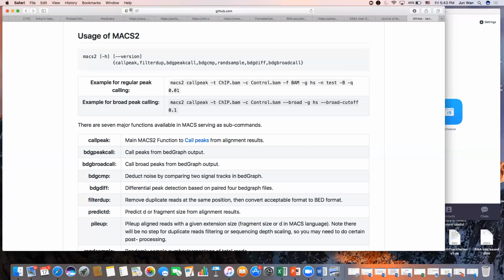Dr. Wan, would that be the advisable step, seeing an IT person for permission? Would that be recommended? Yes. Let's try that, and if not, we'll find another reasonable solution. I think I'm getting the same thing. Okay, so that's two. Dr. Wan, you want them in MACS2, correct? Not MACS1? MACS1.4 doesn't have a broad call. I don't think so either. I didn't see that in the manual. So let me talk to our IT guy, and I'll get some information back. But please talk to your IT guys as well. I may have a suggestion for that.